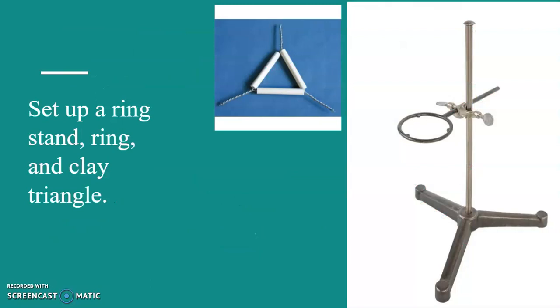Okay, all right. So just a little bit of background on chemistry so you recognize some of the words. We're going to set up a ring stand. So here's a ring. That one's not too hard to figure out. And here's a clay triangle. This goes over this ring, and it holds whatever we want above a Bunsen burner flame.